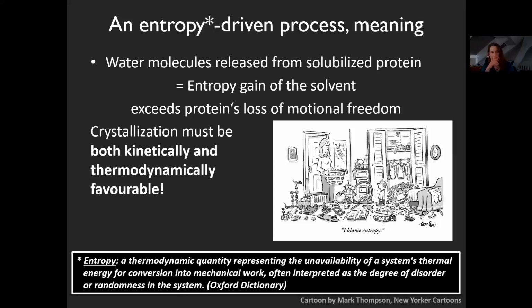Nucleation rates, growth kinetics, so how do the molecules bump into each other in order to form the lattice? What are the microscopic foundations? These are all questions you should ask yourself, not only in theory, but also in practice.